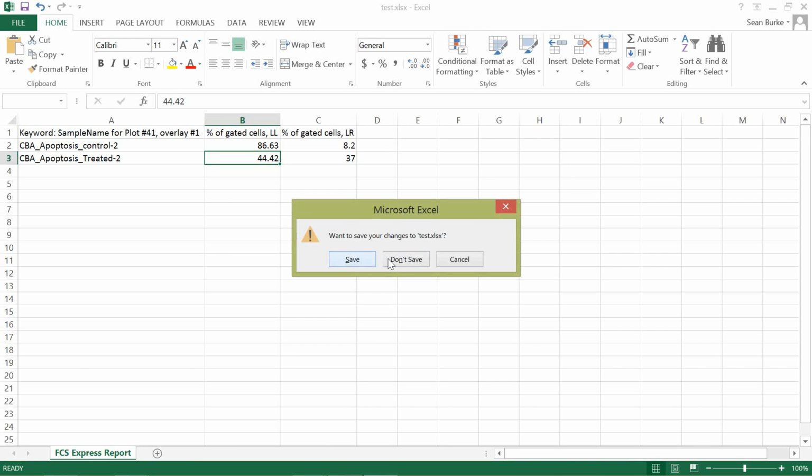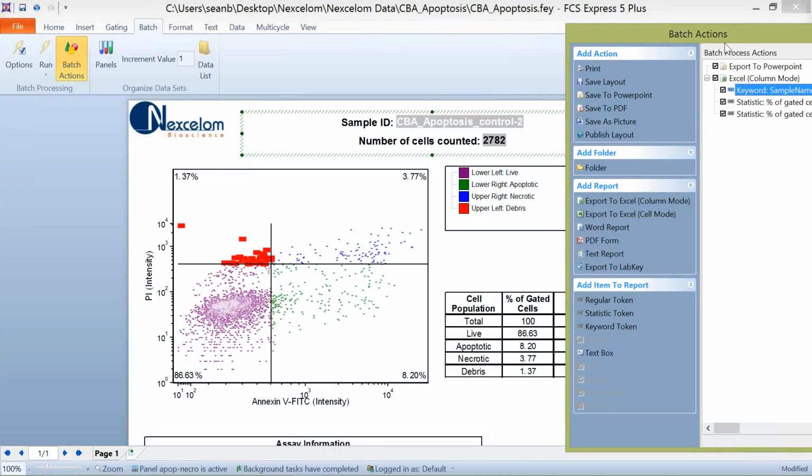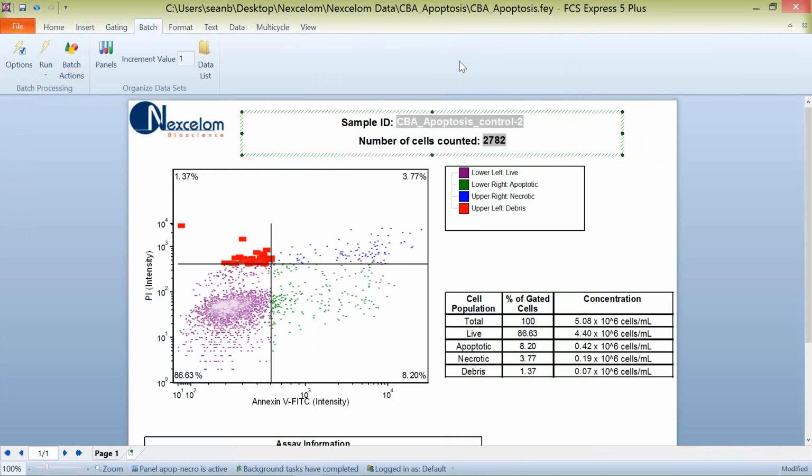to work through that. I've heard very positive responses from CBA Vision customers using FCS Express when we show them how to use this batch process. It seems like it's the next level for some people. Some people are ready to make that jump and some people aren't. But you know that that tool now exists.